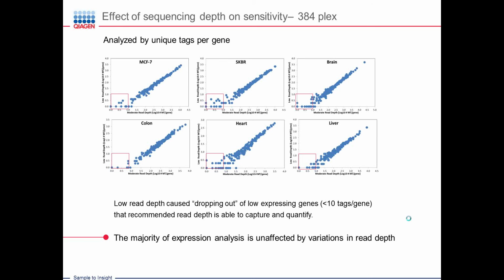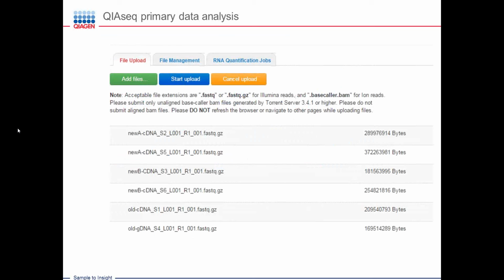So let's just turn to data analysis. When you get a FASTQ file off your instrument, you come to QIAGEN's website and you upload that FASTQ file.